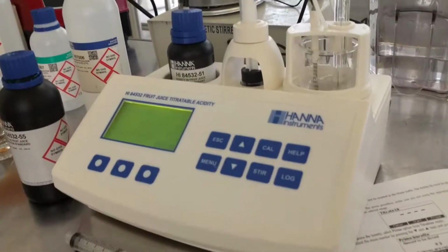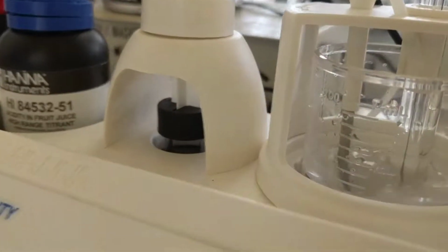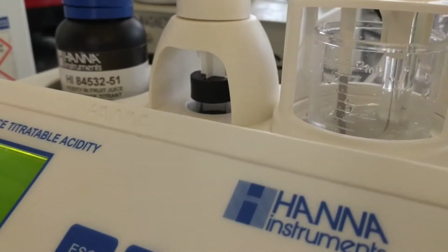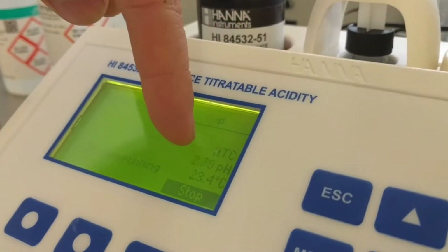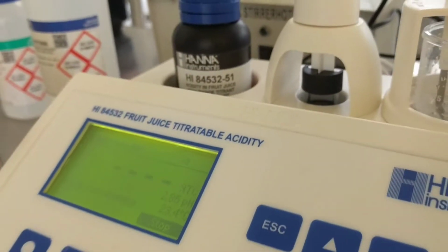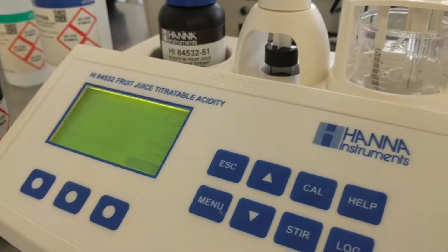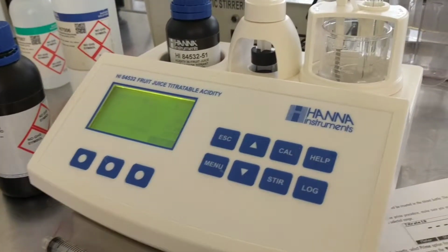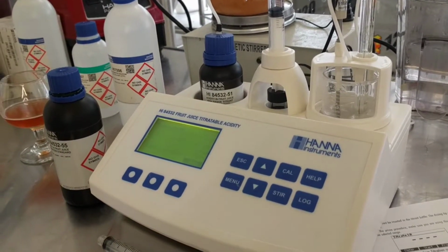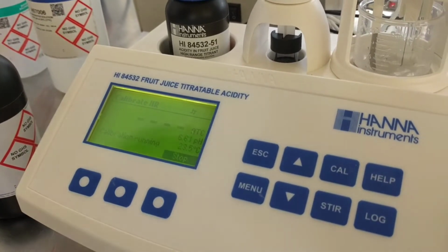Now you can see right here, it's adding a little bit of this titration solution. And as it's doing that, the pH is going up over here. There we go. And then it's just going to keep doing that until it reaches probably 8.20, which is the point of equivalence that we're working out on this piece of equipment. And that's pretty much it. After that, it's going to say calibration completed, and you'll be able to just go ahead with an actual solution that you want to test. That's it. Questions? No?